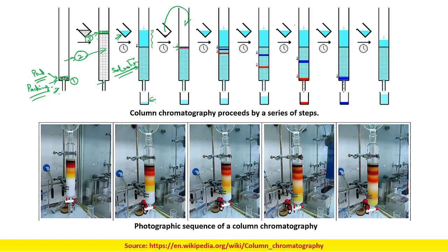Now another important thing which I forgot to mention: why you want to do this upper packing. Suppose you might have seen from the rooftop, when there is rain, if you have some channel-like thing and rainwater is falling onto the ground, you will find that a crest is formed at the position where the drop of water is falling.